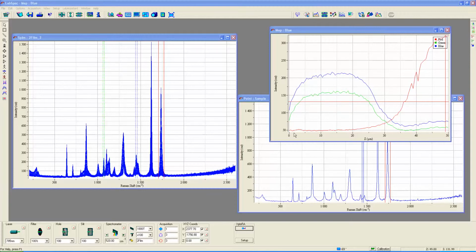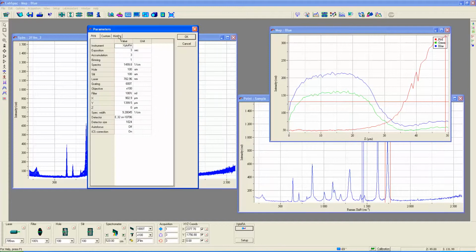which would be at the polyethylene, and that would be approximately the 0 position, and then move the stage up, which is to say move the focal plane of the microscope objective and the laser beam down through the two-layer sample.